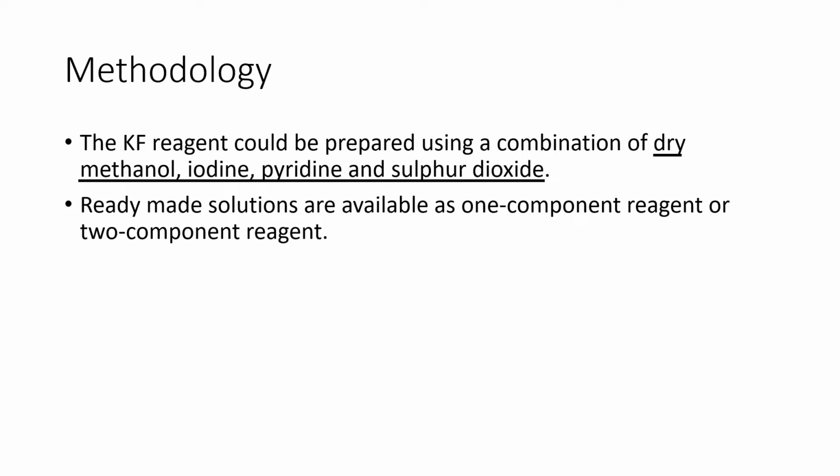Ready-made solutions are available as one component reagent or two component reagent in the market. The one component reagent can be used instantly, whereas the two components have to be mixed before use. There is a sequence to mix also. It is always solution A that is mixed with solution B and not vice versa.